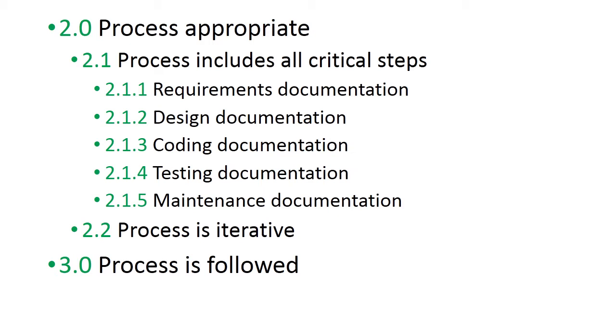Design documentation contains the software design so that there is no confusion related to the final design of the software. Coding documentation: as you must be knowing, softwares are made up of codes, various computer codes. So coding is also a very important part of the software development process, and proper coding should be adopted by the person who is responsible for the development of the LIMS software.